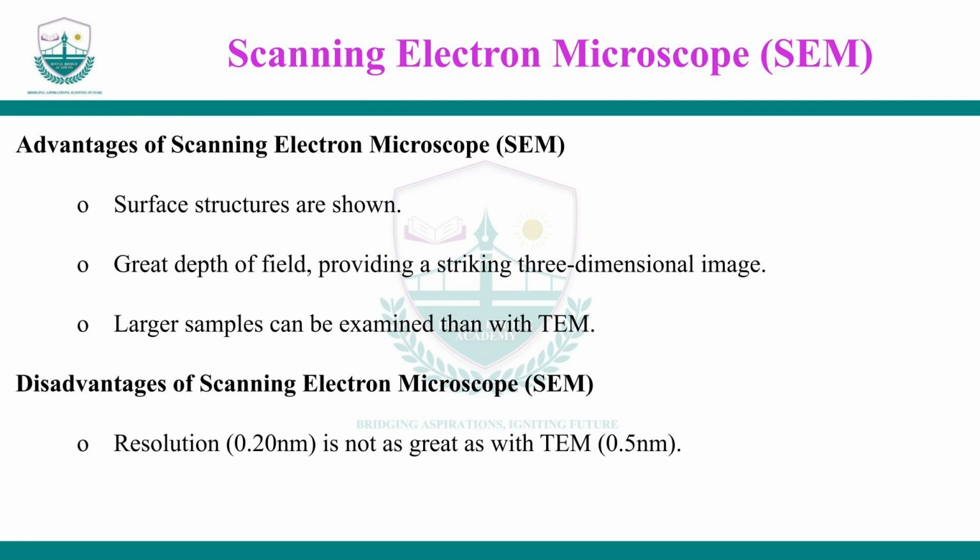Conclusion. In summary, the electron microscope has revolutionized biology by revealing structures invisible to the naked eye. From virus particles to intracellular organelles, its contribution is unmatched. However, we must also understand its limitations: expense, complexity, and the inability to view live specimens.